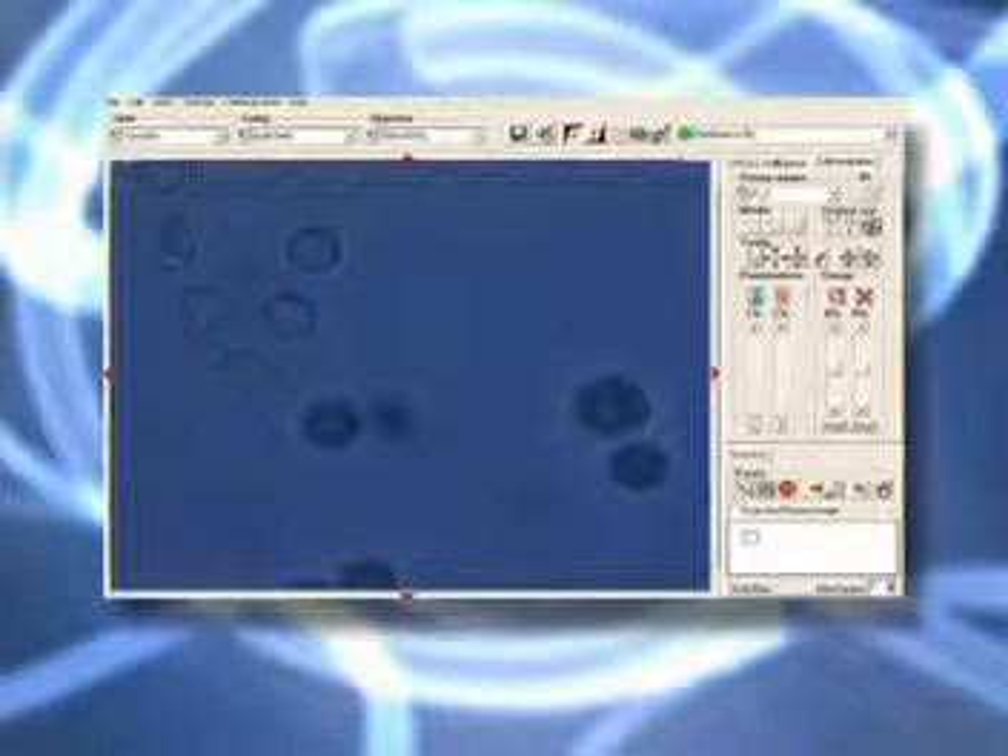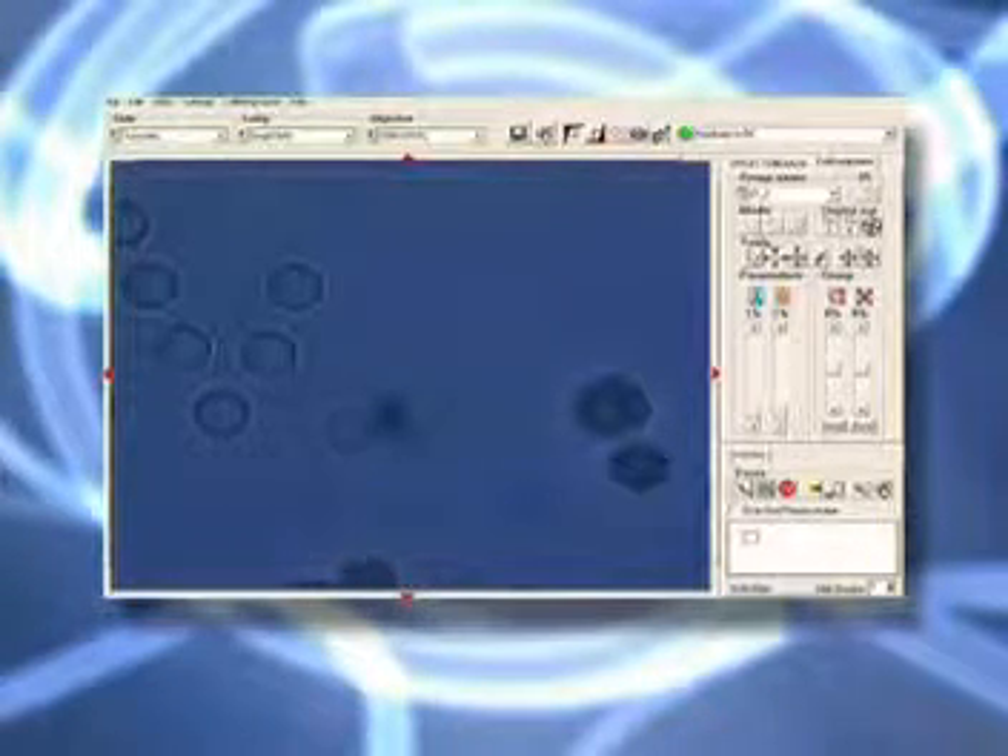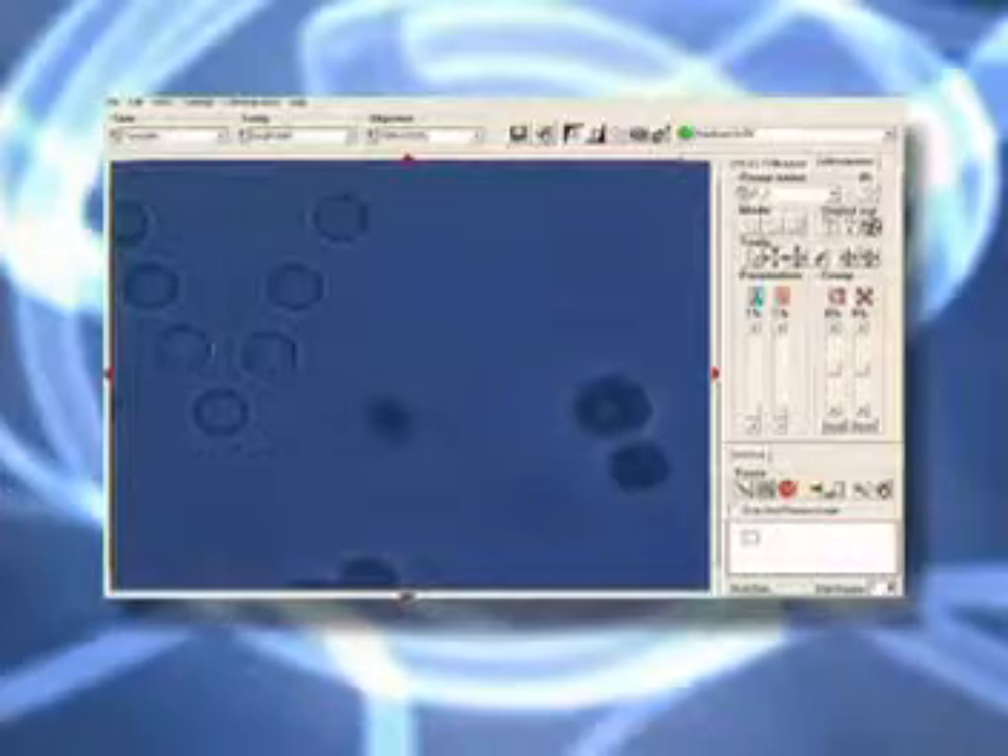The MMI Cell Manipulator can easily be combined with the MMI Cell Cut system. It combines all the advantages technology has to offer to make micro-manipulation precise, contamination-free, and comfortable.